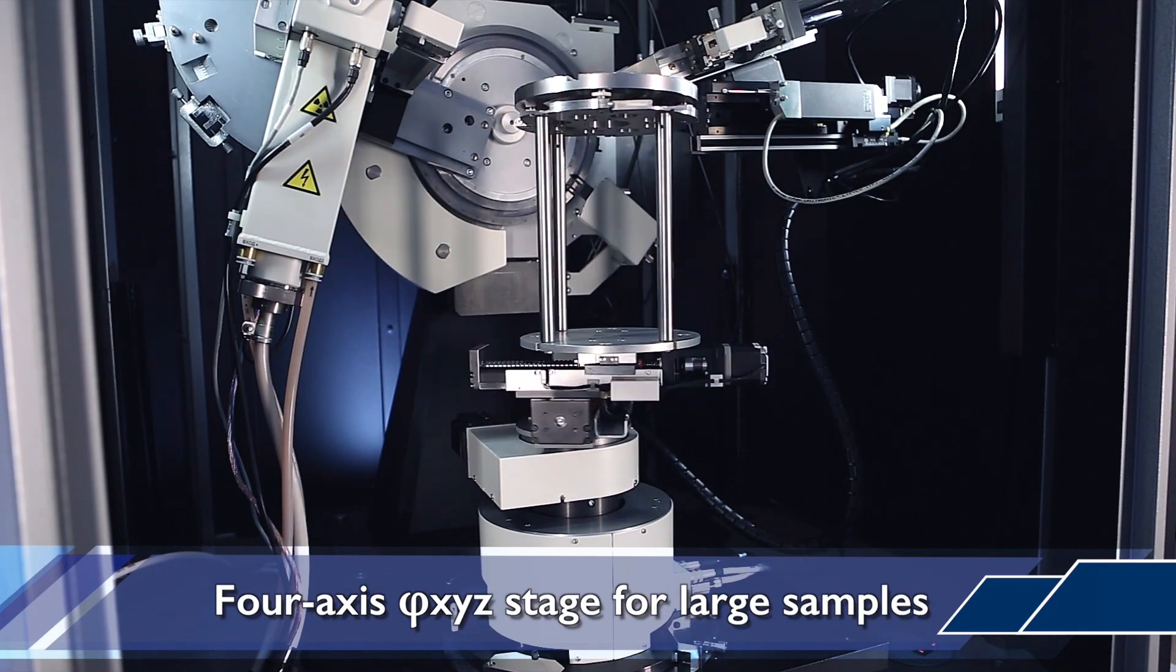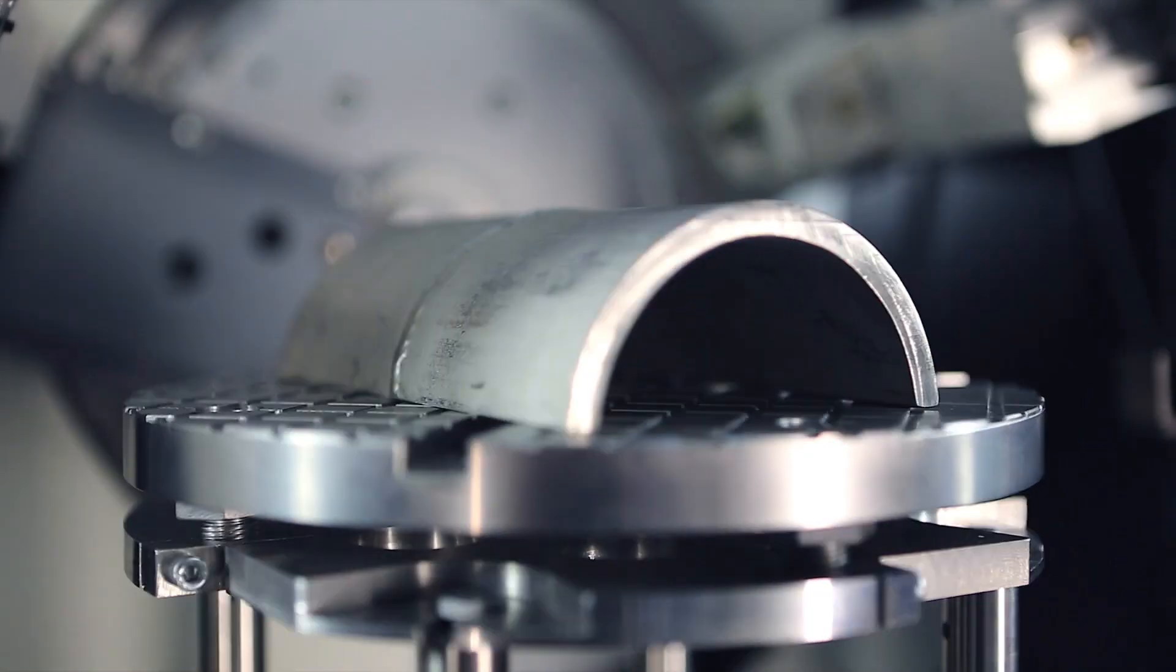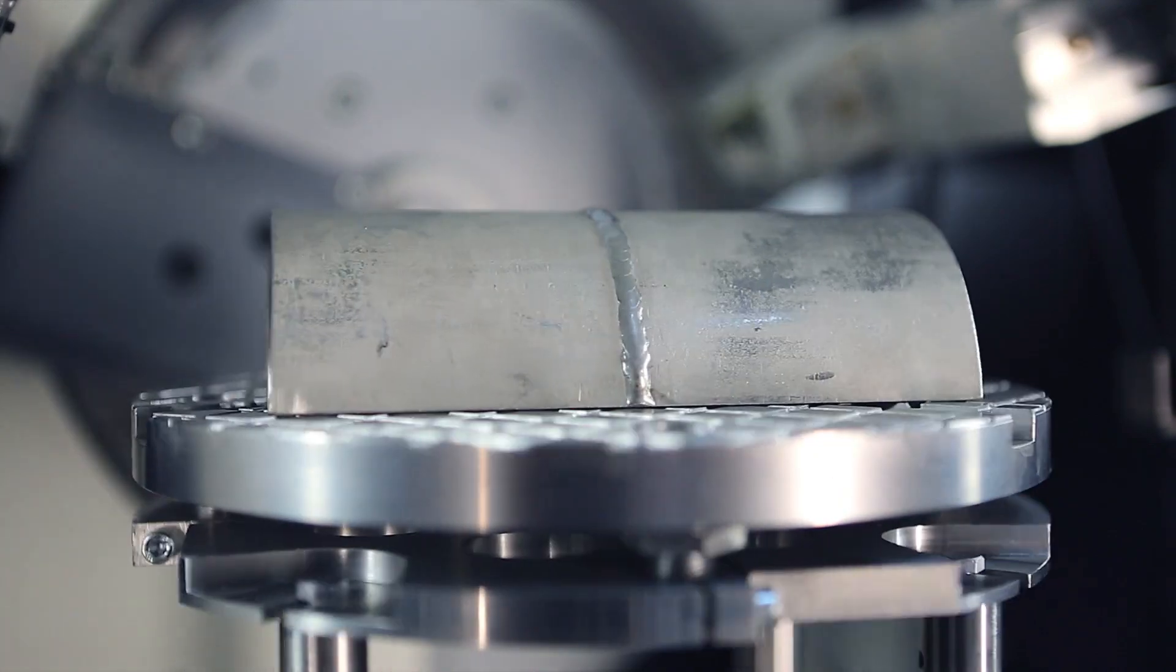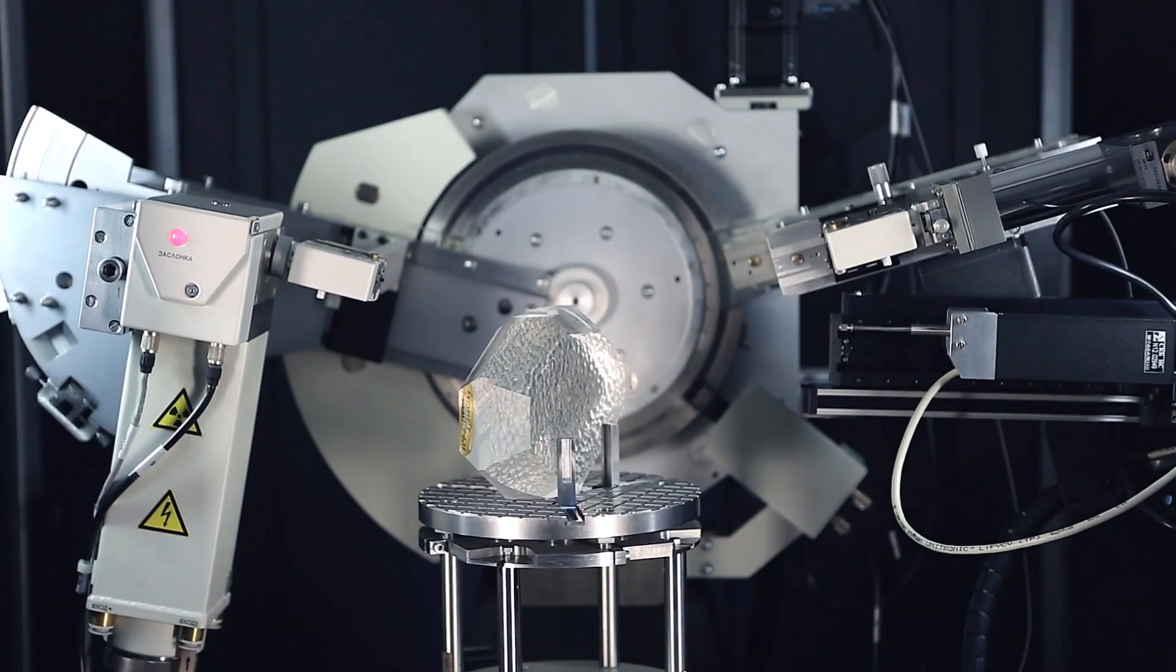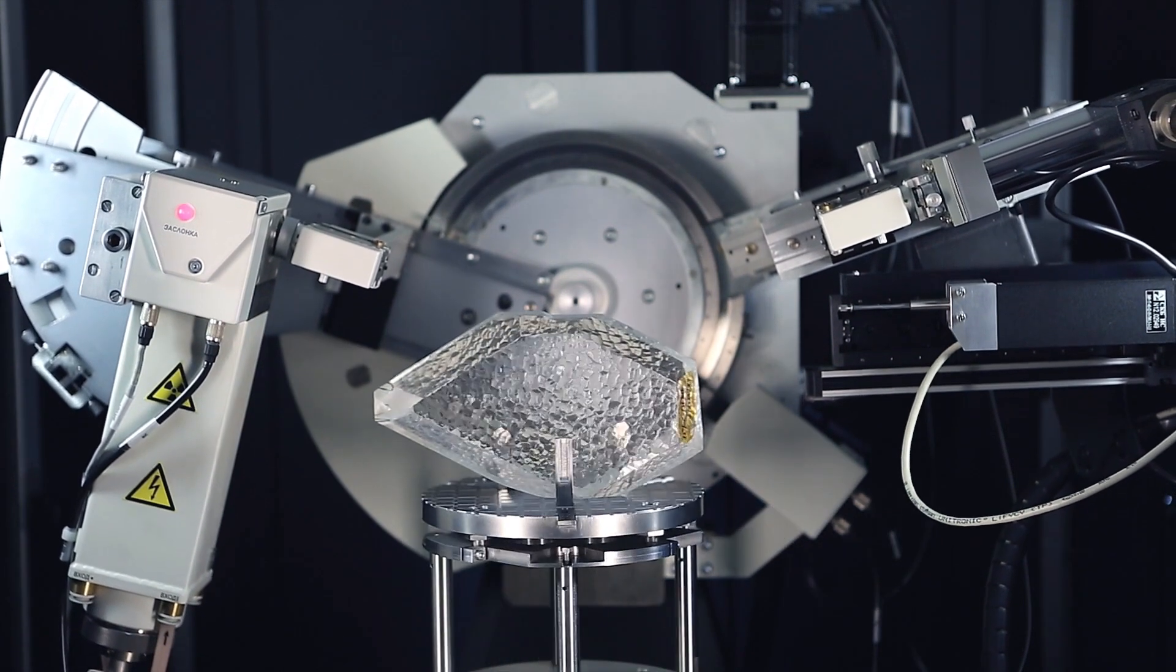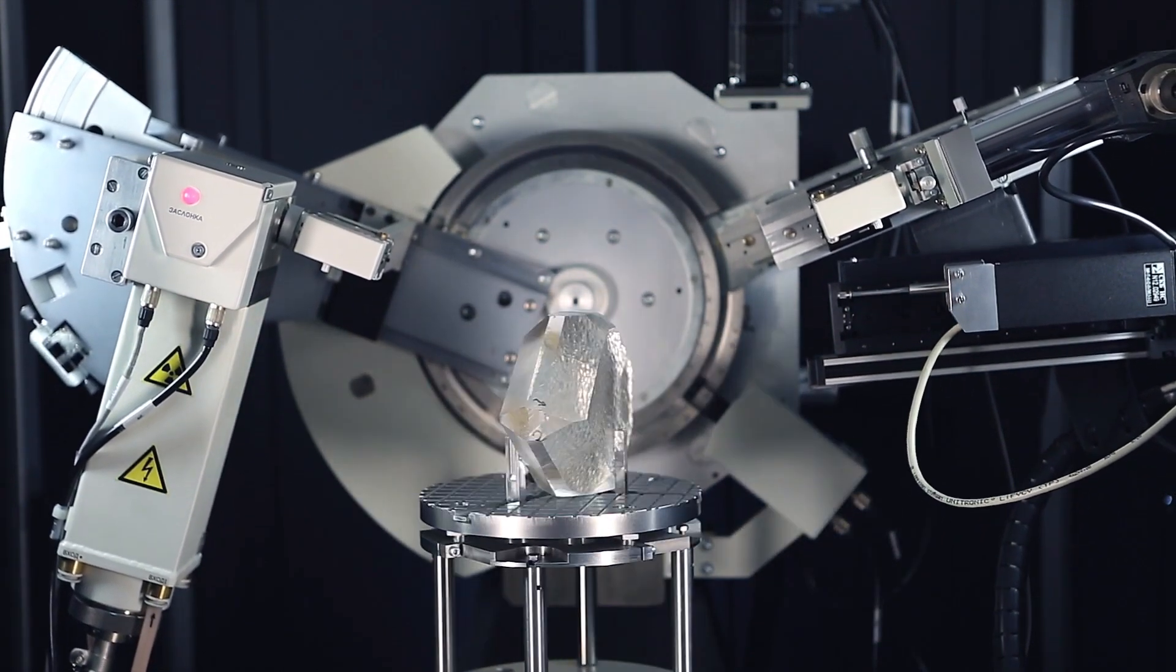Configuration of the instrument with the holder for large samples provides the examination of objects of any shape with diameter up to 300 millimeters. Sample weight may reach 50 kilograms.